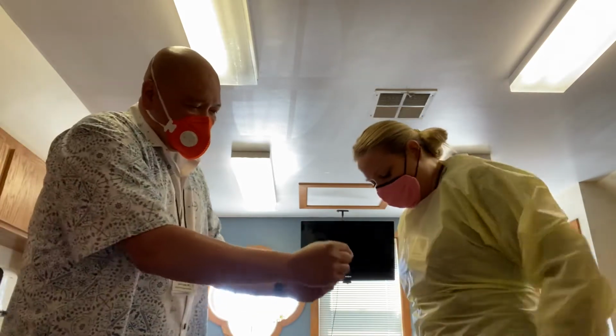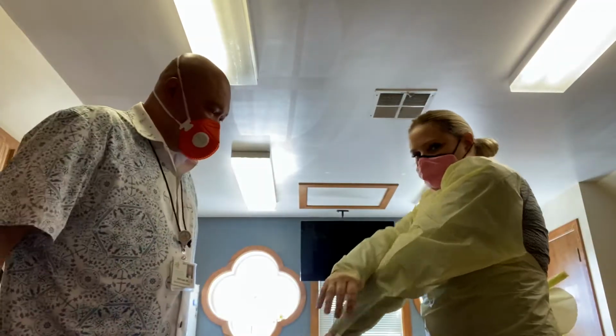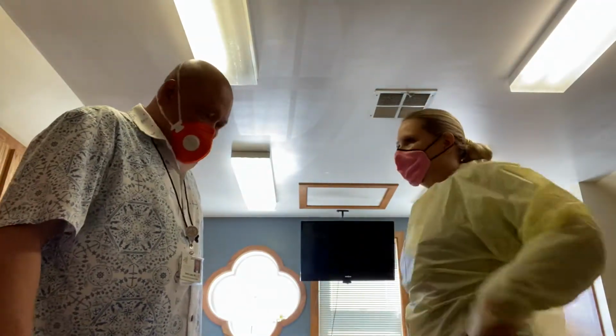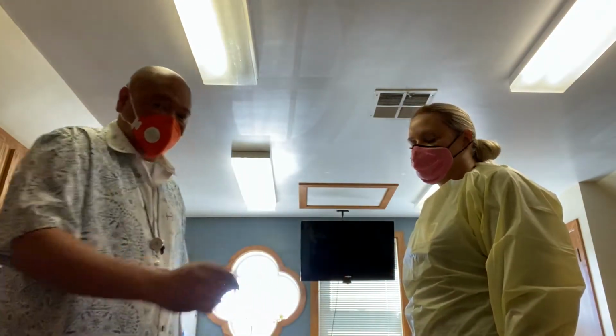Now when she's tightened up her gown, she needs to make sure that she's moving around, making sure that she has good range of motion. Oh, so I don't tear it. Yes. Okay. The next step that she needs to put on is her N95 mask.